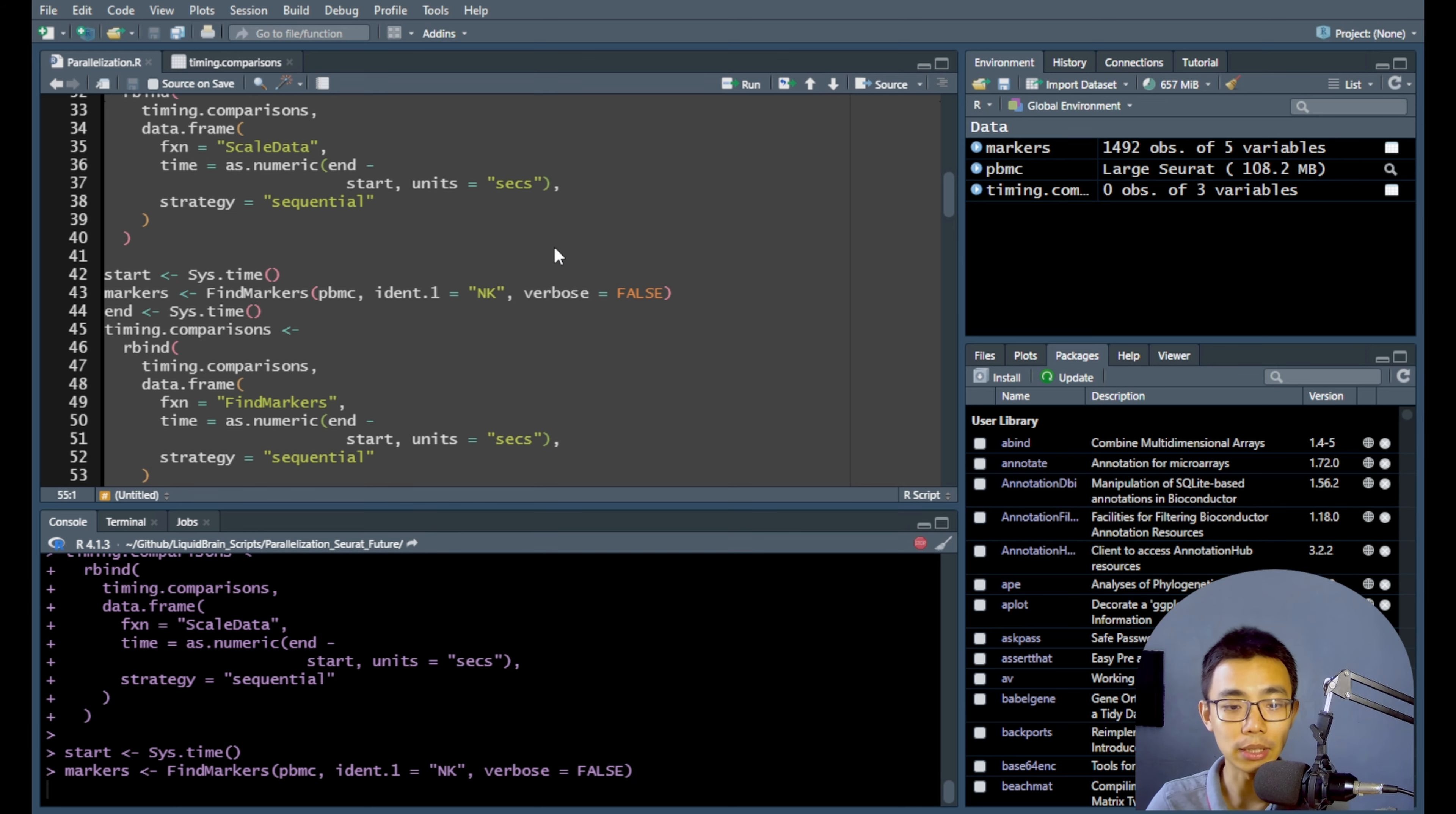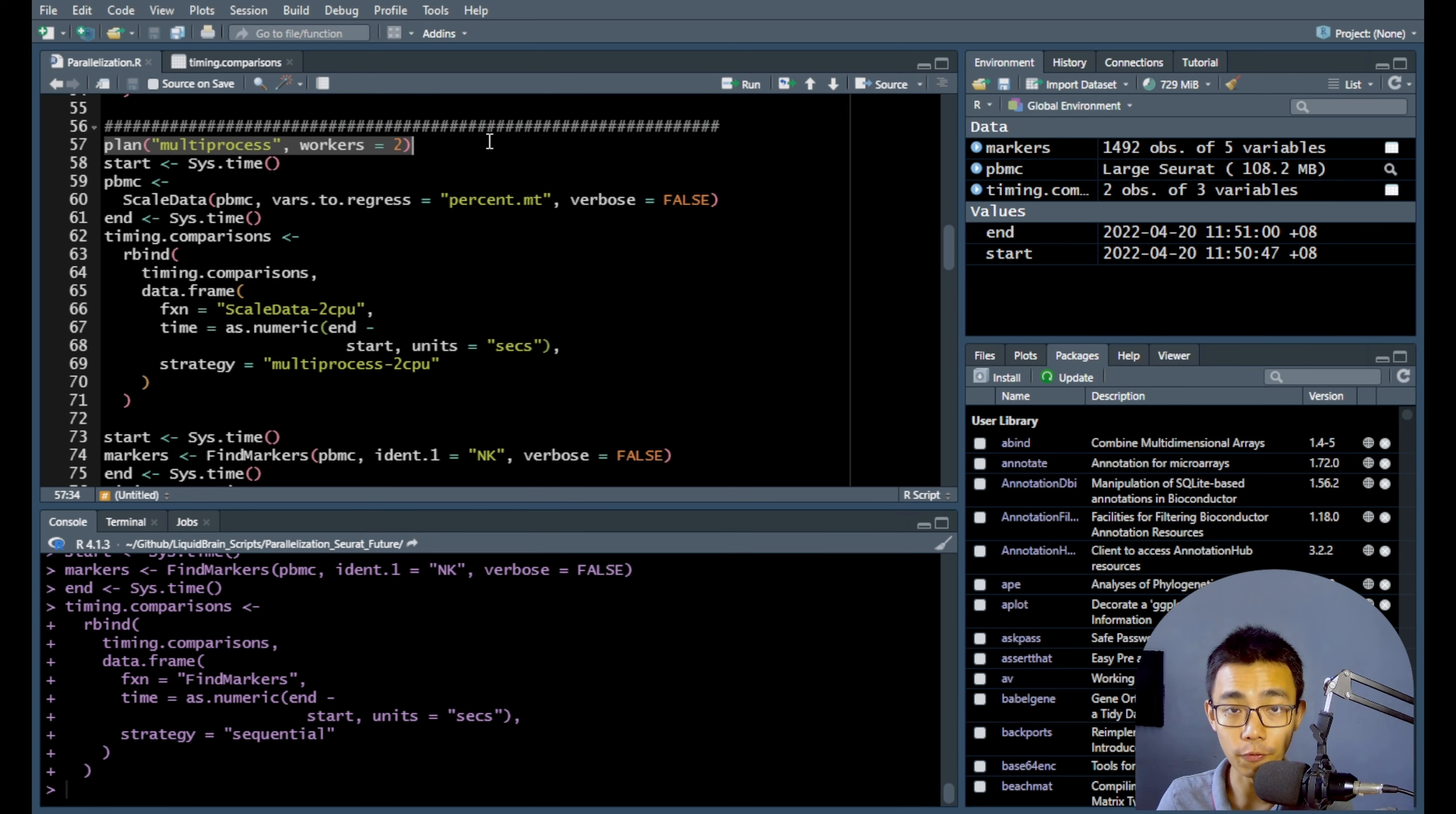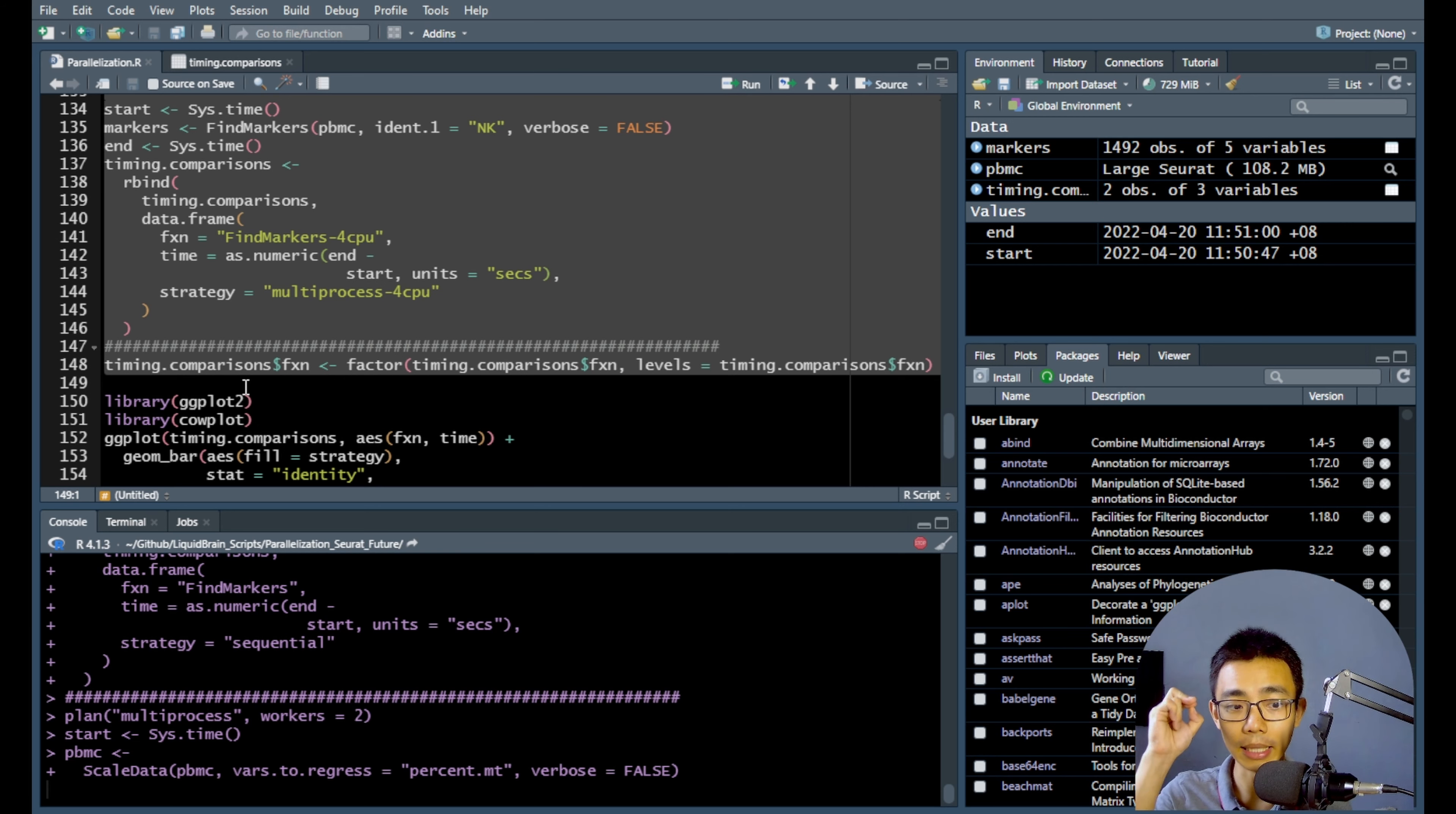So this is, of course, the sequential data and for the multi-threaded data from two cores to four cores, it's basically the same code four times, just changing the plan to multi-process with the worker of two, three, and four. Okay, so let's just actually run the two, three, and four and we should be able to do this. Okay, this will take a while. So maybe I'll just cut this here and we'll come back in a second.